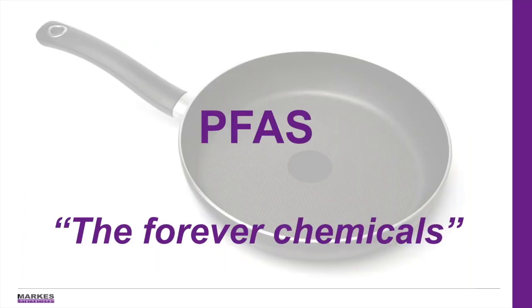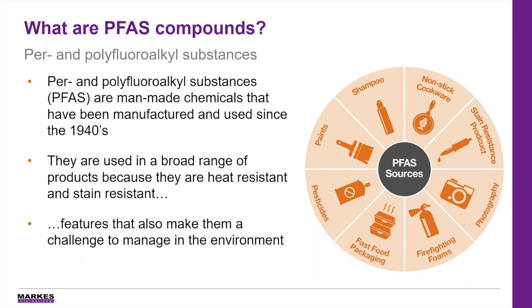Now, our final application is PFAS. Now, PFAS are the forever chemicals, and they're in the media a lot at the moment. But what exactly are they? So, PFAS stands for per and polyfluoroalkyl substances.